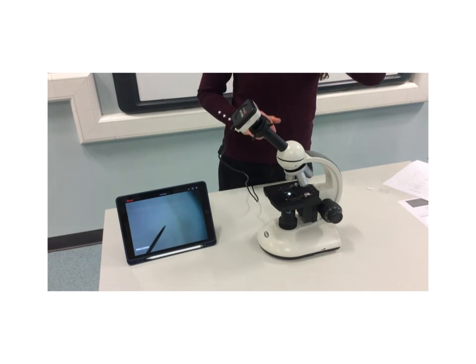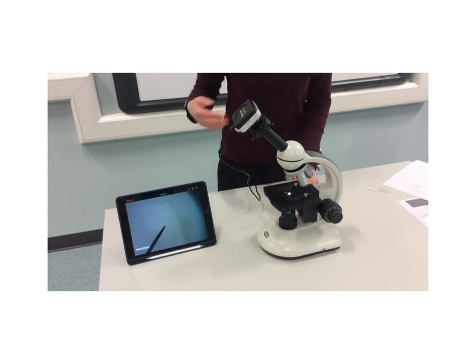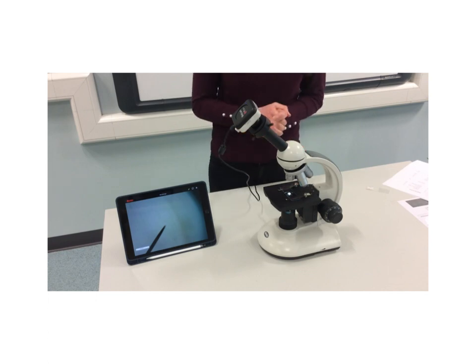We need some sort of light source, either a light coming directly below the stage, as it is in this one, or a mirror that's reflecting light off another light source. So those are your main parts of the microscope, and it's really important that you learn them really well.